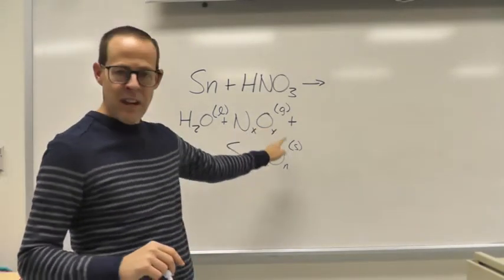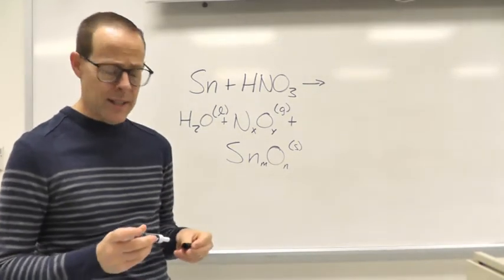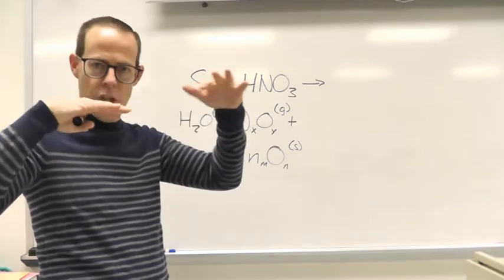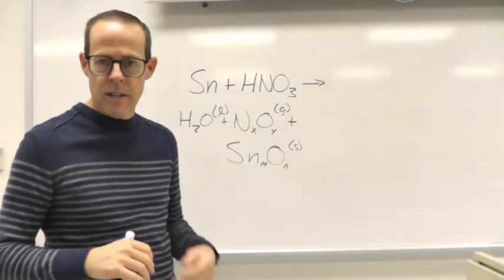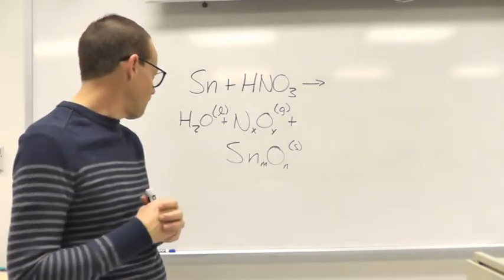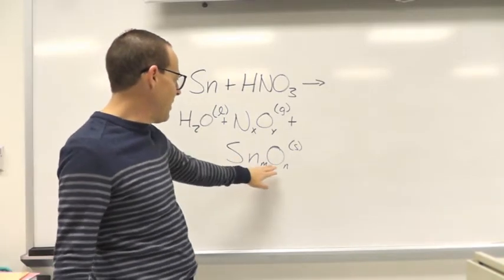I'm making nitrogen oxide, which is a major component of smog. So if you've ever been to a big city, LA, Houston, anything like that, there's kind of like an orangish haze that's always above the city. That's mostly nitrogen oxides from exhaust from both cars and like manufacturing plants. Water, obviously, you know what water is. But we're going to make some kind of tin oxide.